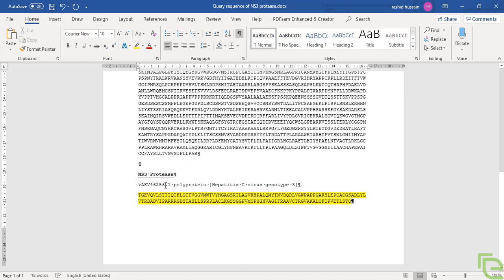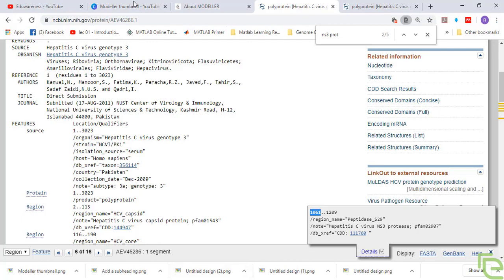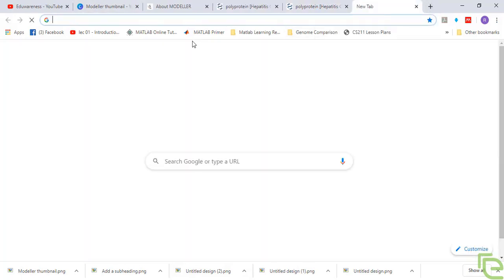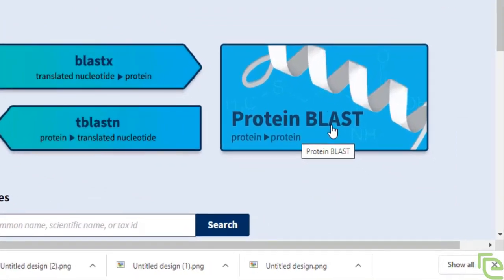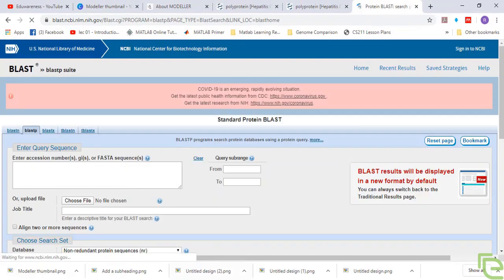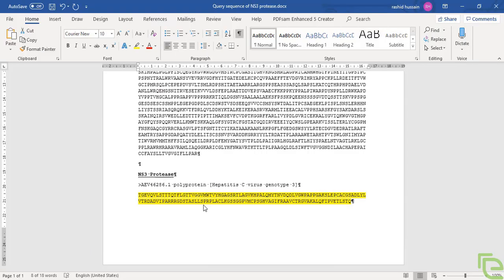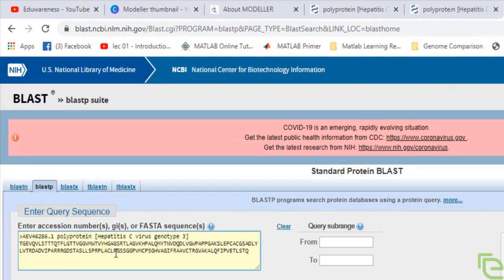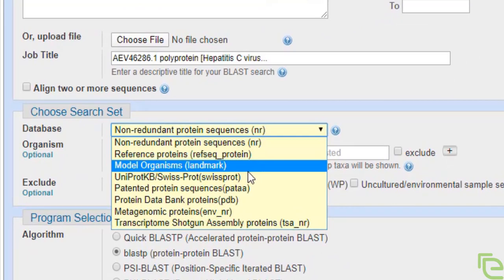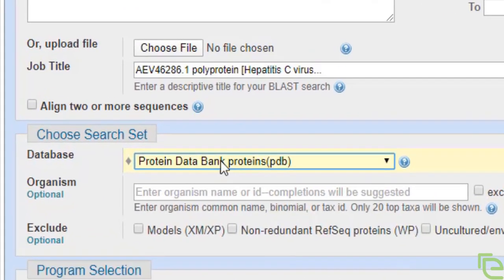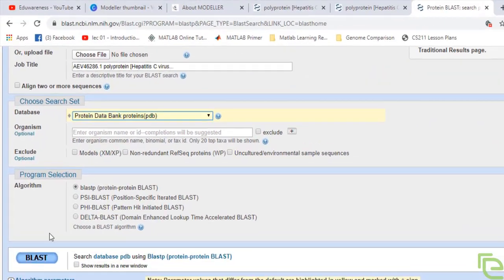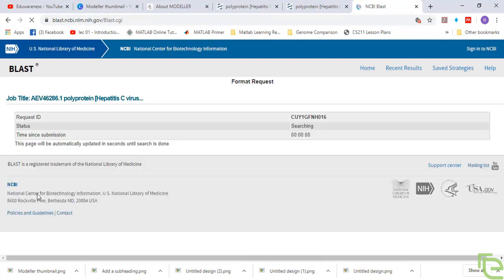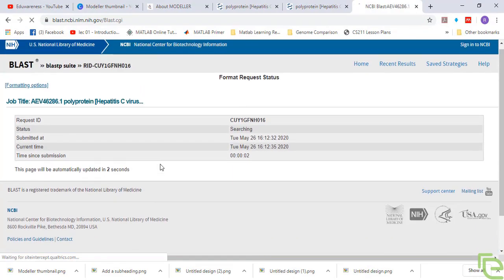We'll go to BLAST with our query sequence that needs to be modeled, and look for proteins that are most similar to this query sequence. We'll go to Protein BLAST, copy the sequence, and choose the Protein Data Bank as the database because we need to find proteins with the most resemblance to this query sequence from PDB. This is BLASTp and we'll run the search.